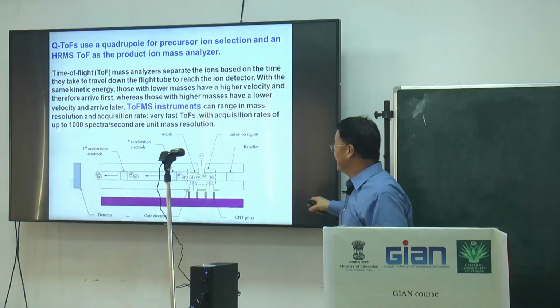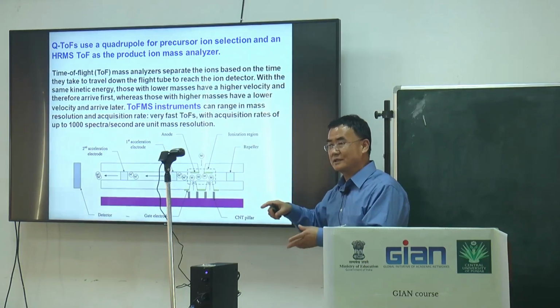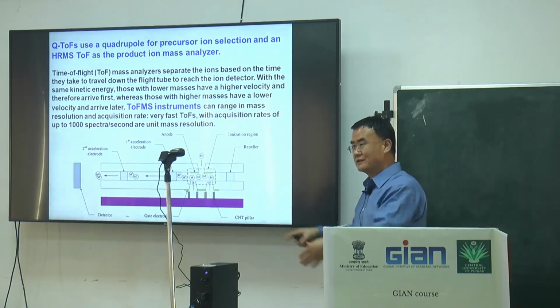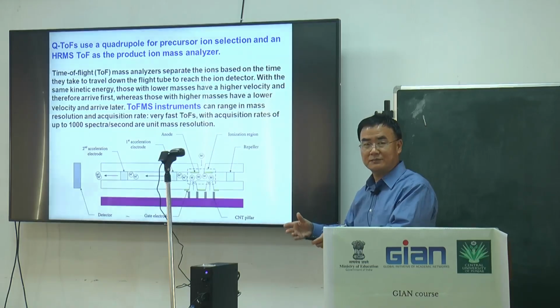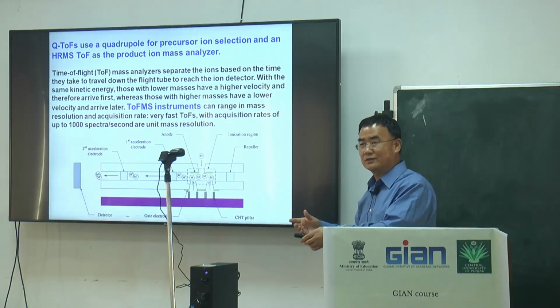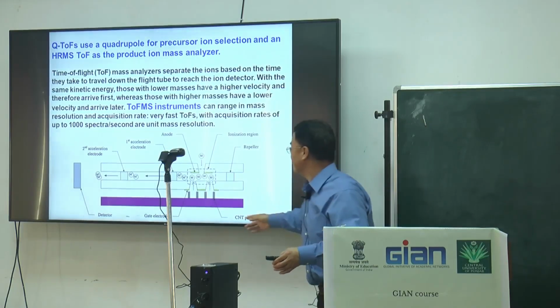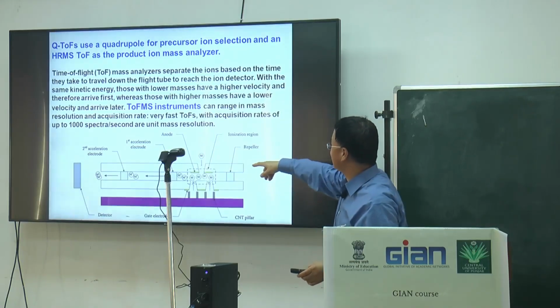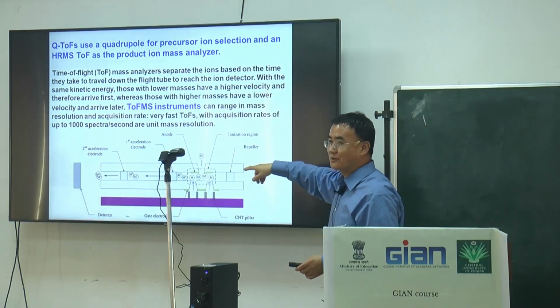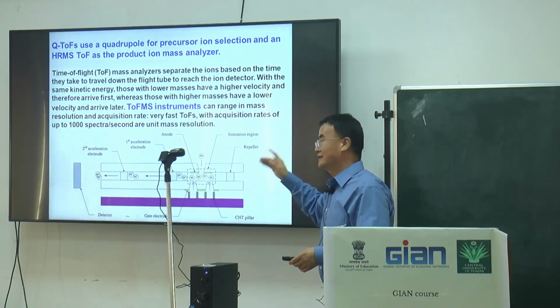If the energy is not enough, you can adjust it from your interface and increase it. There is a first and second accelerating electrode to make them continue to fly.